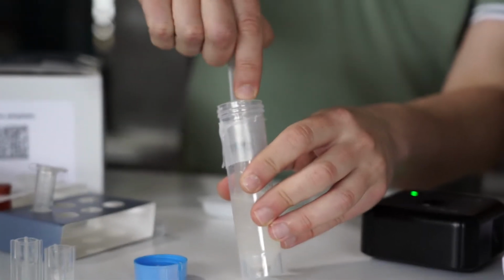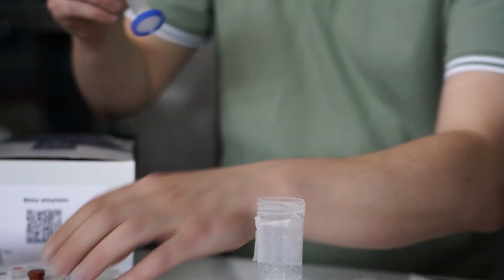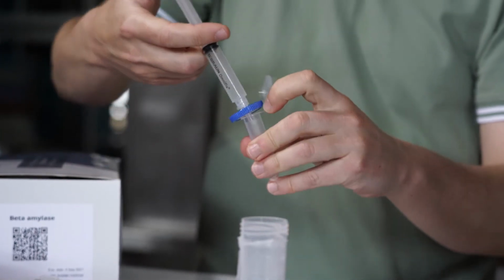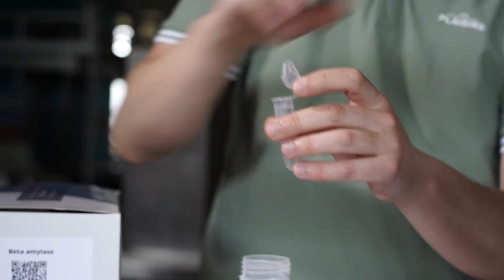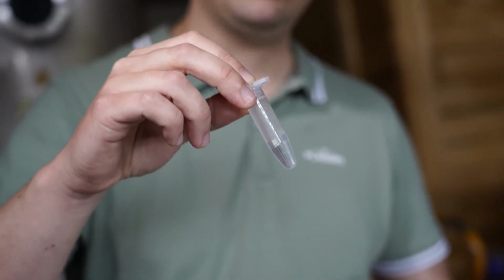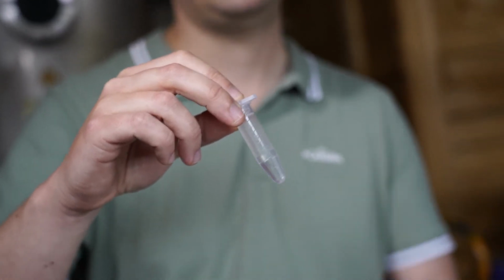So we use the syringe that is included in the kit. We take around 5 milliliters, it doesn't need to be very precise, and then what we do is we filtrate around 5 milliliters of the solution. Now we have a clear solution with the enzymes of interest, in this case beta amylase, and what we will do is to incubate these enzymes with our own substrate.